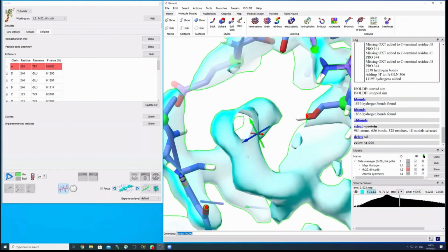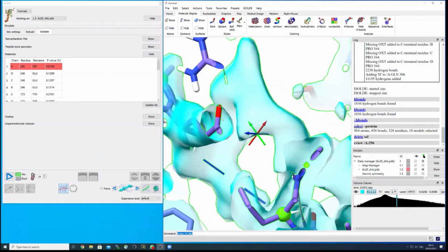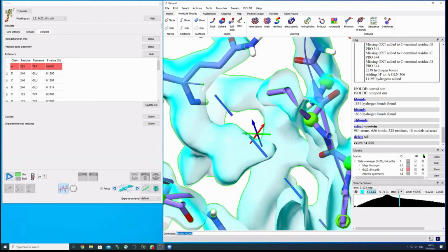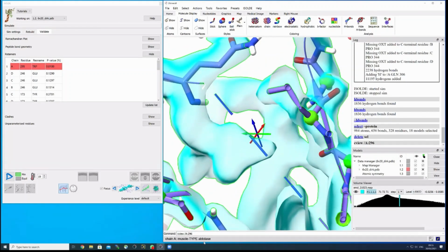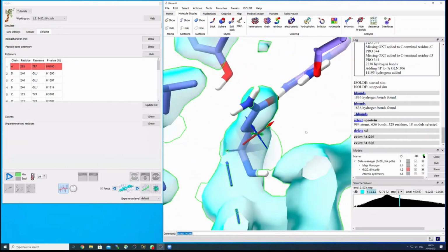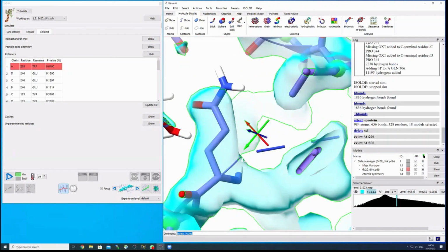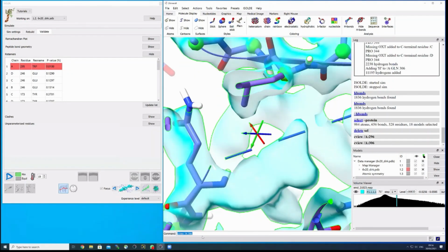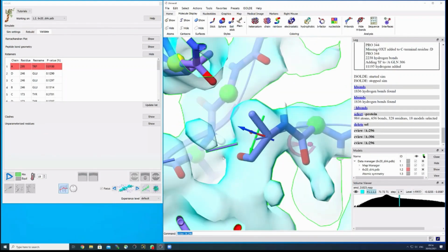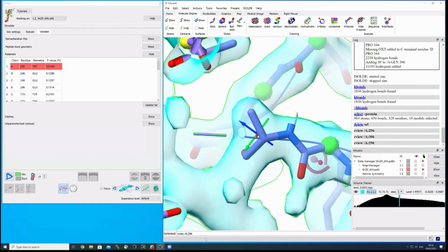Okay. The way ChimeraX depicts a disconnected chain is basically this dashed line. And it's a straight line between the C terminus and the N terminus. So here you see the N terminus, which is position 306. So if I go 306, you see this is where the N terminus is. And you see this pseudobond, which is a dashed line, and will be a straight line to where the C terminus is, which in our case is 296. So if I go there, you see the other end. And in between is what is missing.